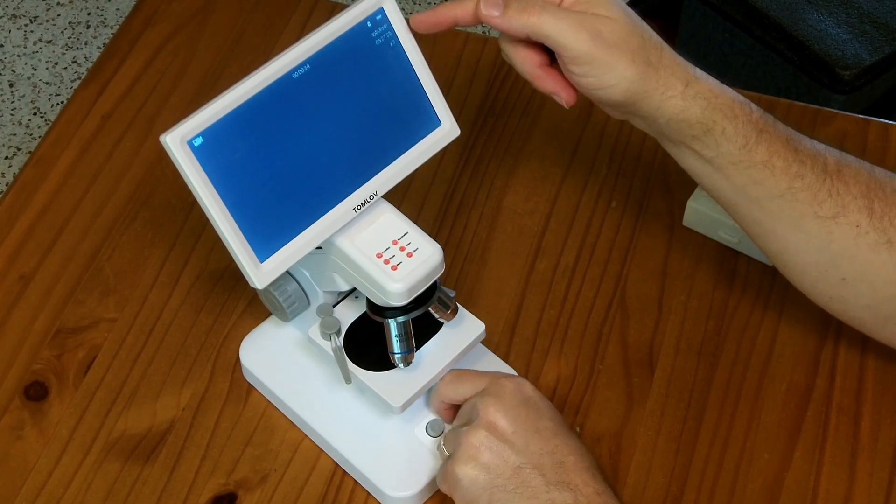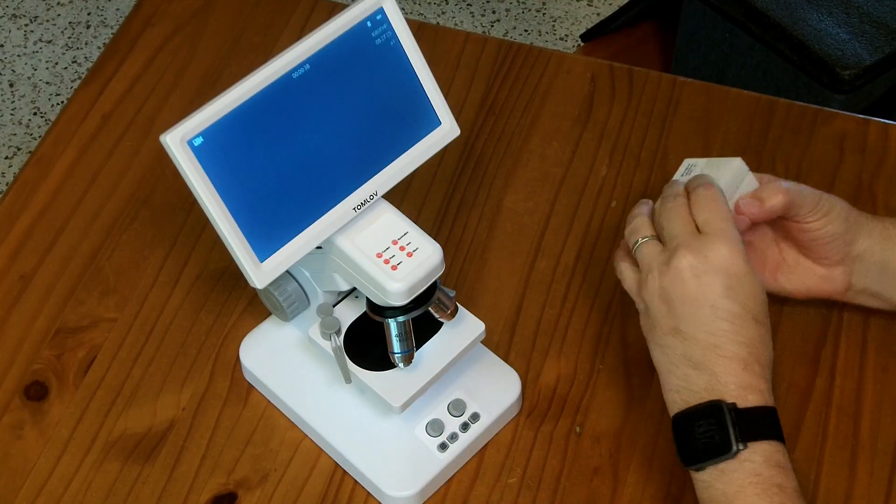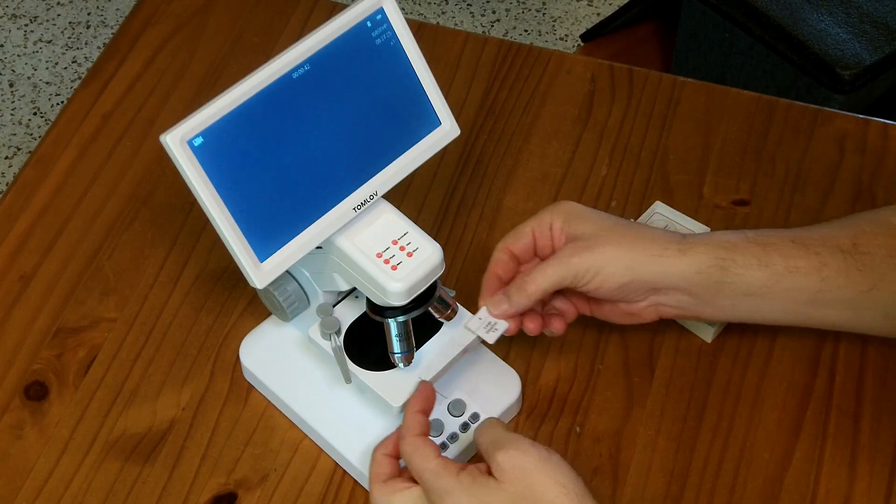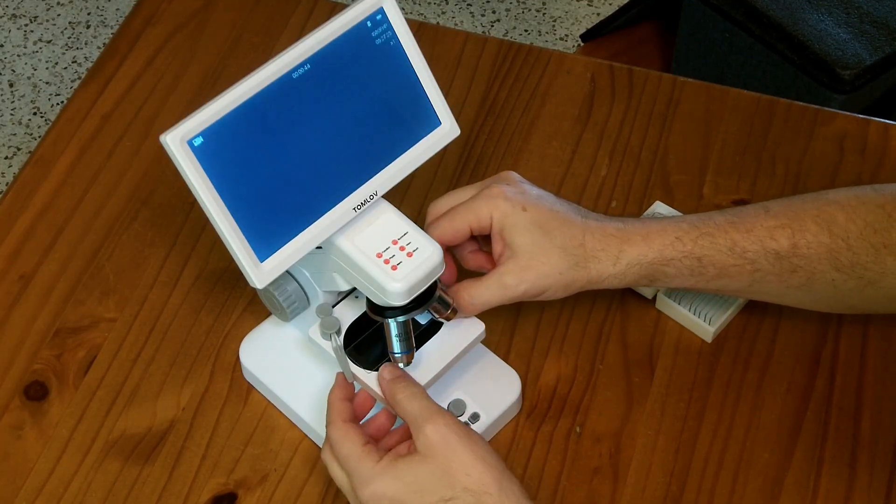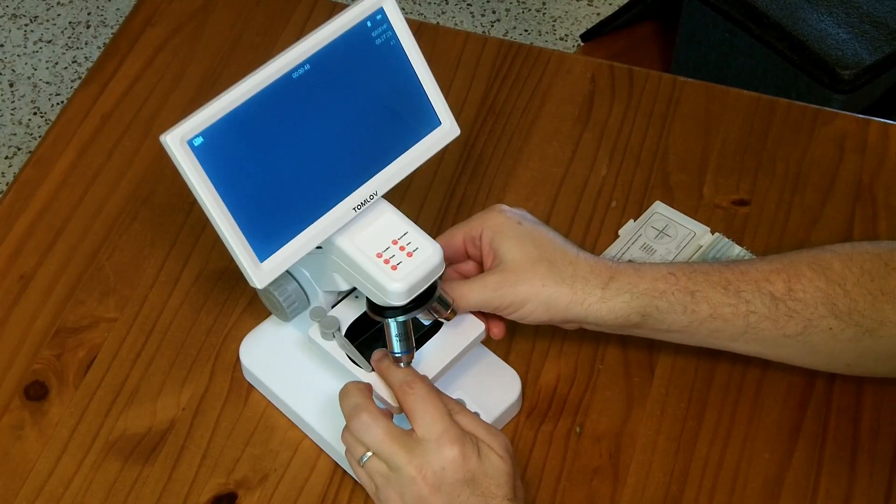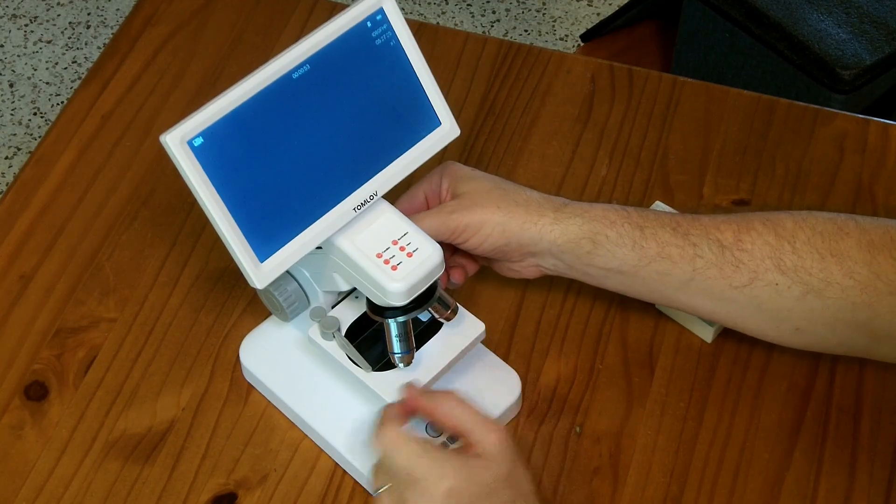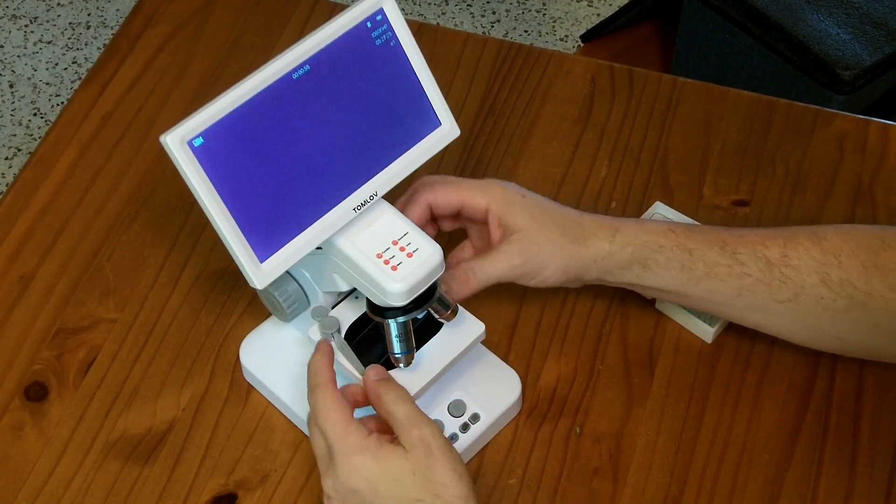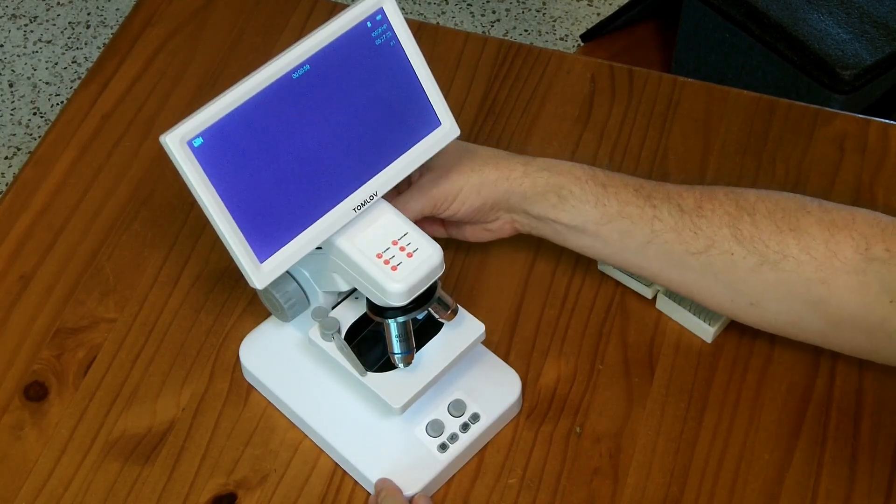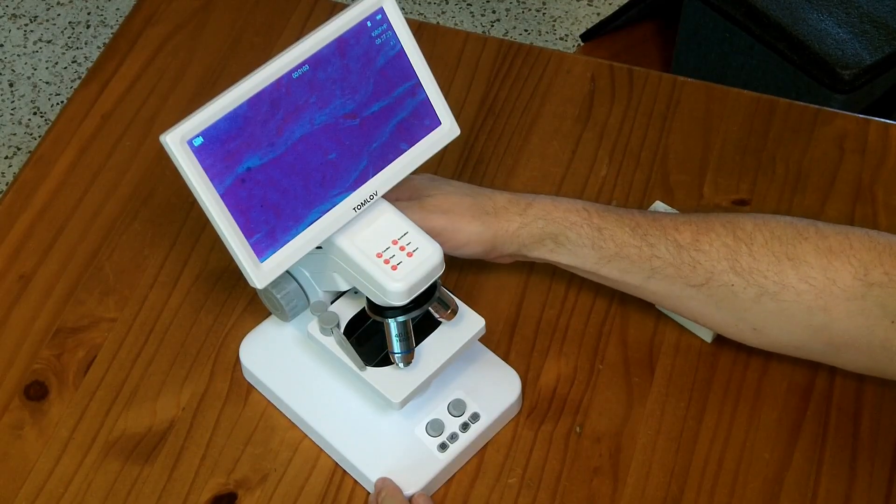We have a digital zoom. Now let's put a slide on. We're going to put a slide on the stage here. And this does not have an XY, so you have to orient this guy appropriately to get it in the viewport. And then we have to focus with the knobs on the back to raise the stage up and down.